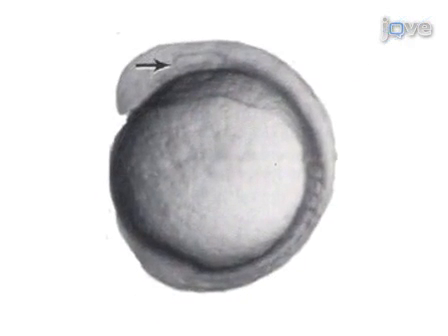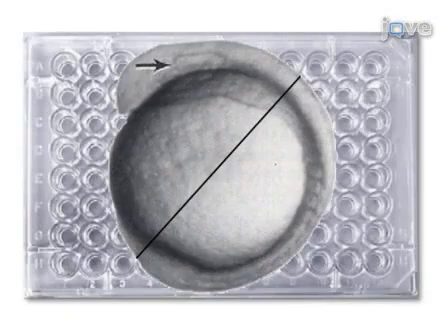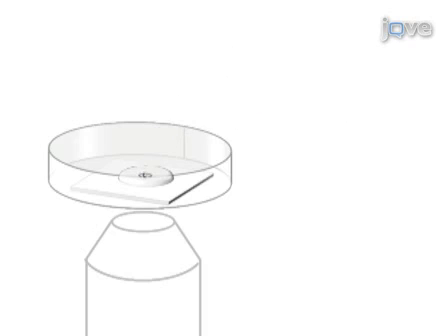Embryos are then immunolabeled with anti-GFP and sectioned, enabling visualization of the morphology of single cells at high resolution in a fixed preparation. Alternatively, live embryos can be examined using time-lapse video microscopy in order to image cellular dynamics. Results are obtained that show cell morphology or dynamics. Here, the zebrafish hindbrain is imaged with confocal microscopy.